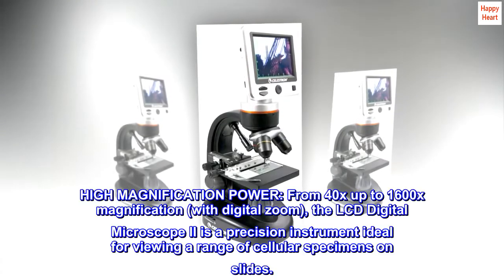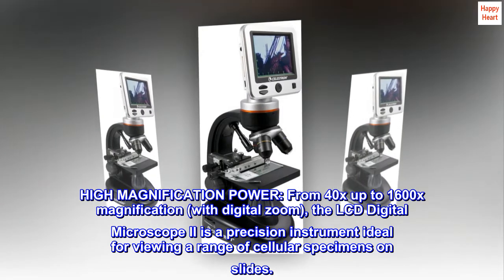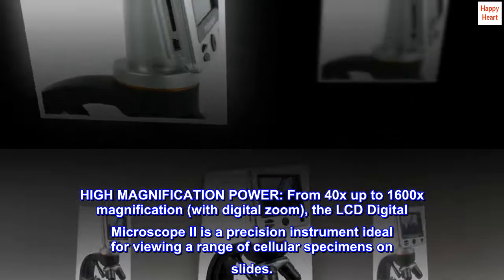With high magnification power from 40x up to 1600x magnification with digital zoom, the LCD Digital Microscope 2 is a precision instrument ideal for viewing a range of cellular specimens on slides.